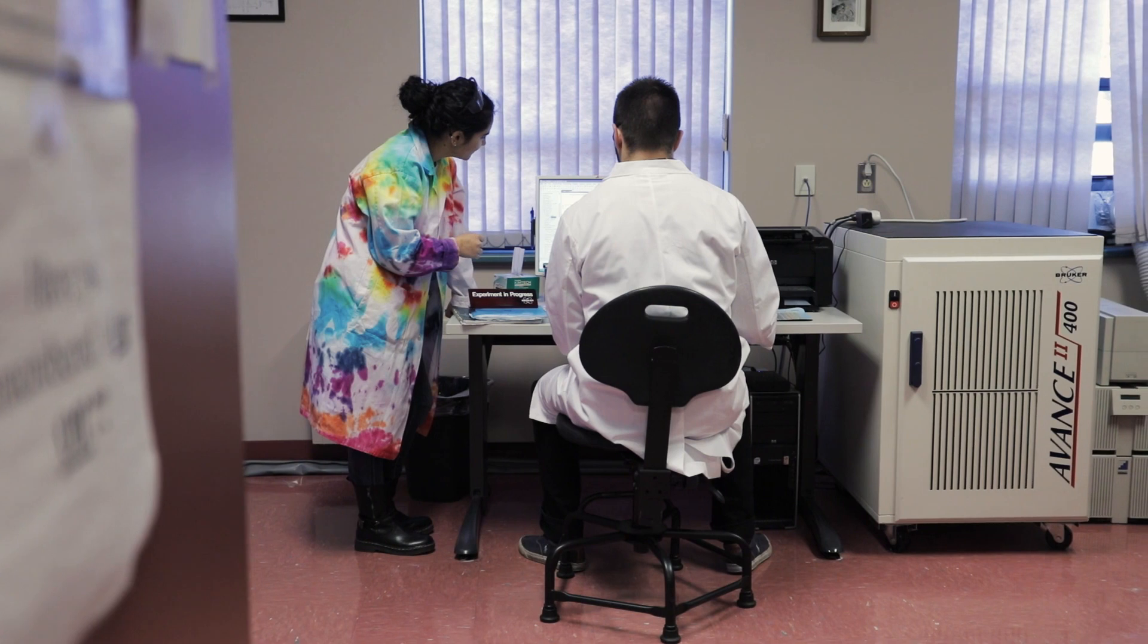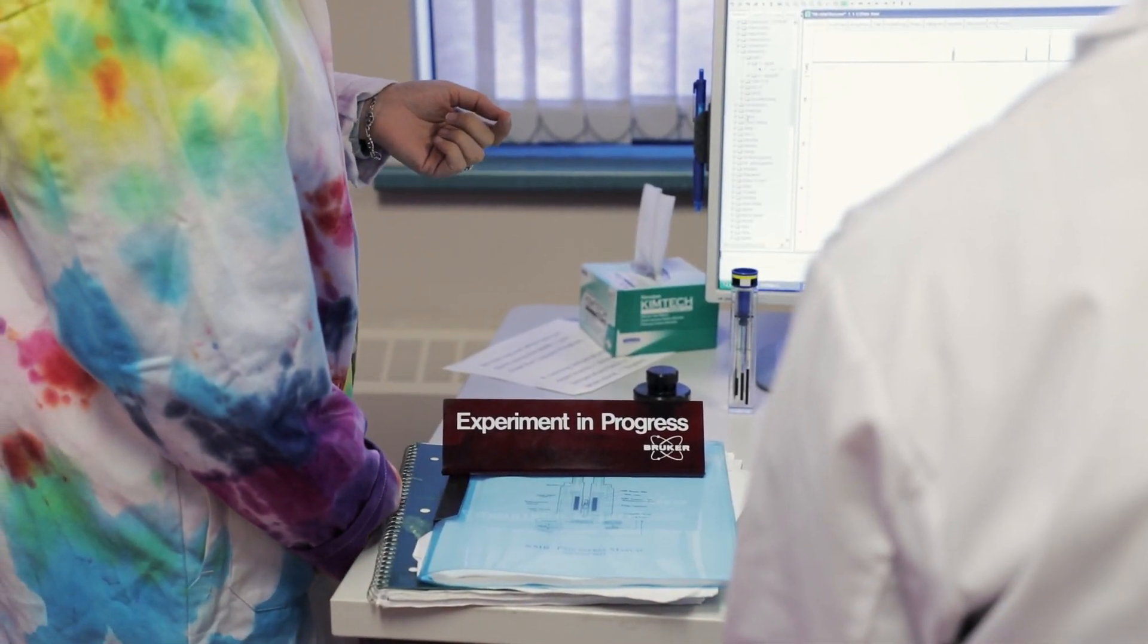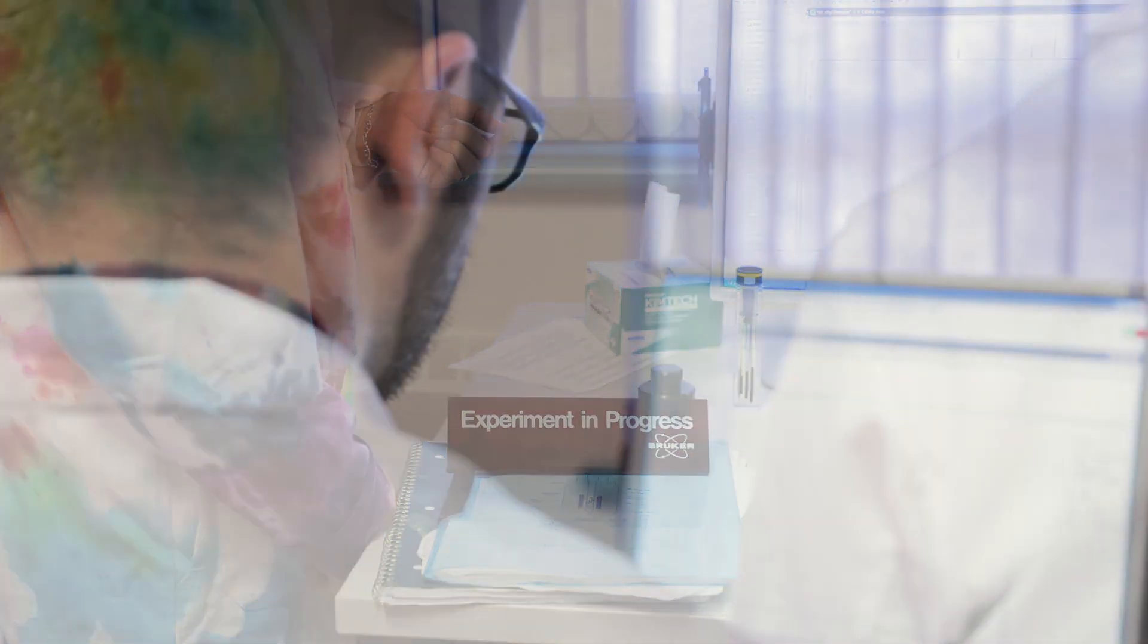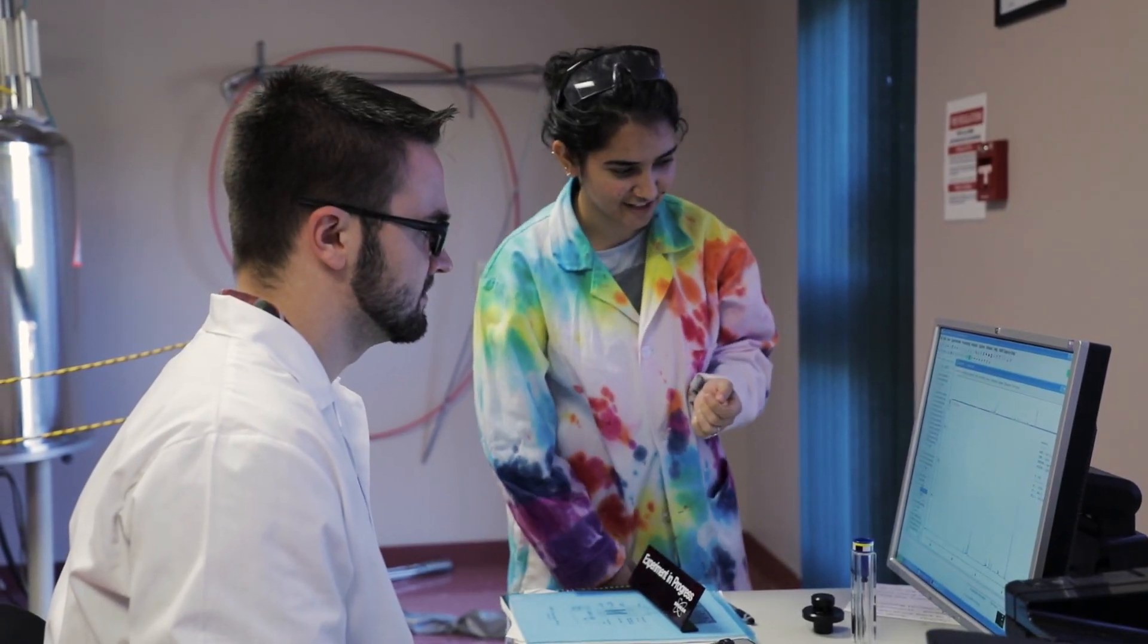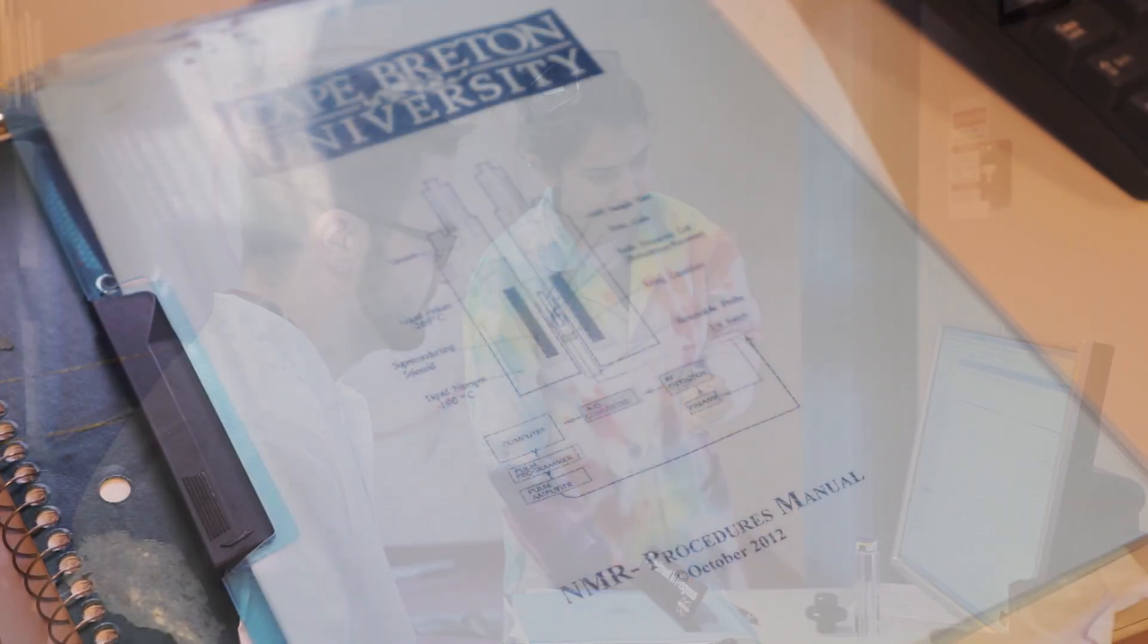Having experience on using NMR and ESR has helped me a lot of times. I've been doing research in organic chemistry, so we deal with spinning of atomic nuclei, so we use NMR for that and it really helps us a lot.